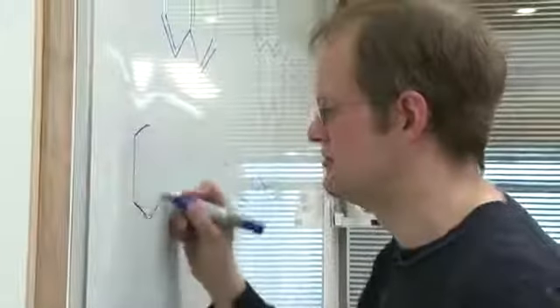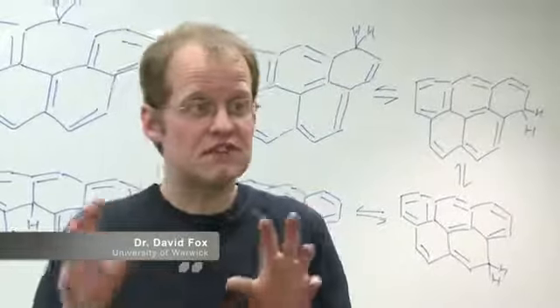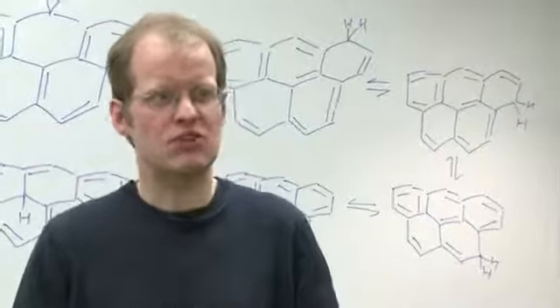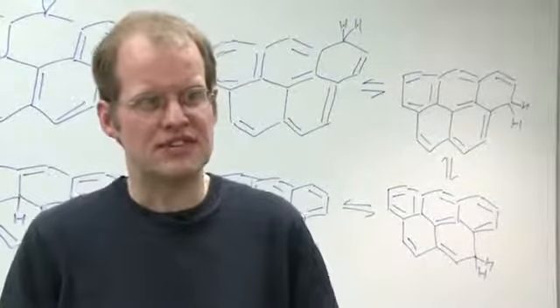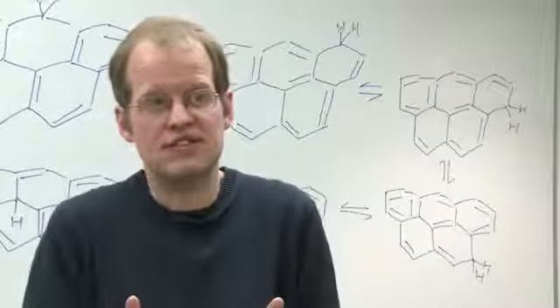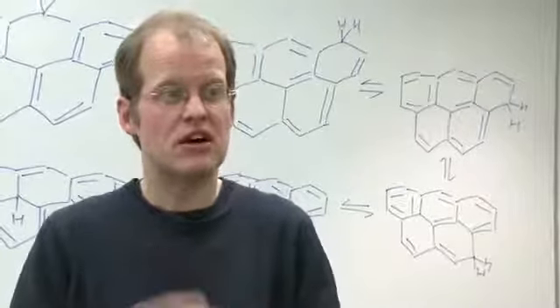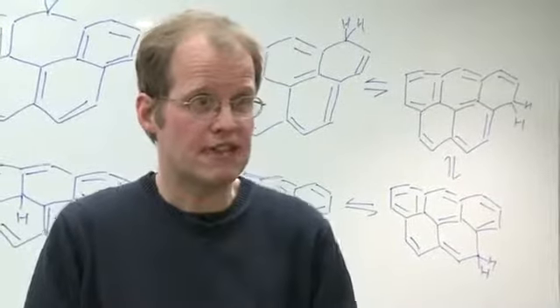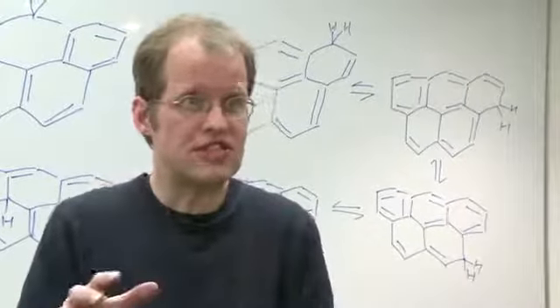Professor Fox explains. The compound in itself is quite interesting because it has a number of different forms which potentially can interconvert, and so in making this compound, one of the things we wanted to do was understand a little bit more about it and see whether or not ultimately we could take a picture of the molecule using some high resolution imaging. The compound is one of a number of related compounds with potentially interesting electronic and optical properties. The compounds potentially could have use in making the next generation of solar cells or new generation lighting sources such as LEDs.